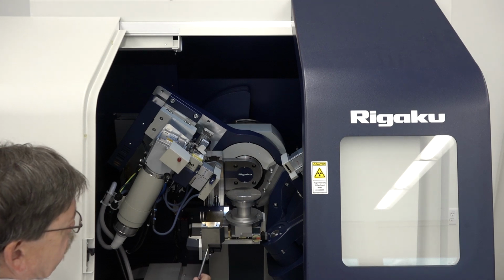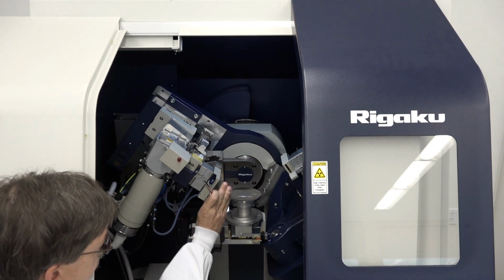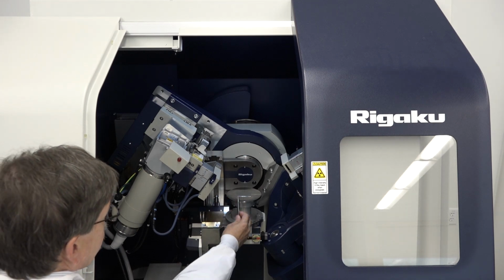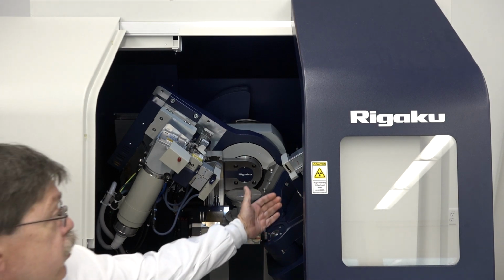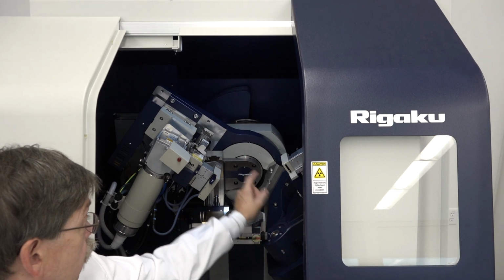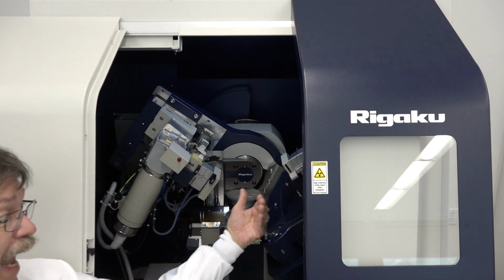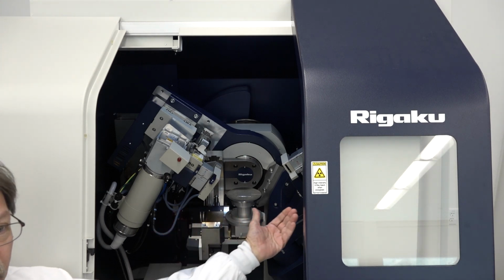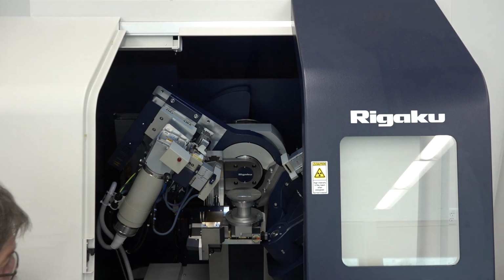Some of the things that are special about this: you notice that this gear right here allows us to rock the sample back and forth, and we can do that as it is rotating about this axis. Moreover, the entire detector arm, in addition to moving up and down along with the tube, the entire detector will swing out, which gives us added flexibility for a number of materials analysis problems.